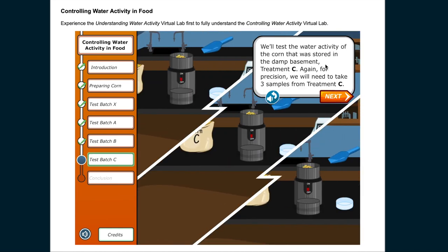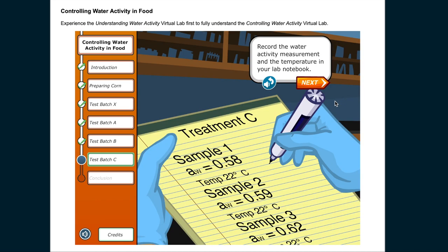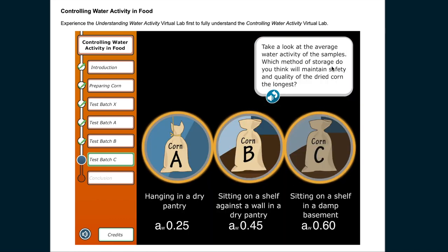We'll test the water activity of the corn that was stored in the damp basement, treatment C. Again, for precision, we will need to take three samples from treatment C. Record the water activity measurement and the temperature in your lab notebook. Average the three samples from treatment C. Take a look at the average water activity of the samples. Which method of storage do you think will maintain safety and quality of the dried corn the longest?